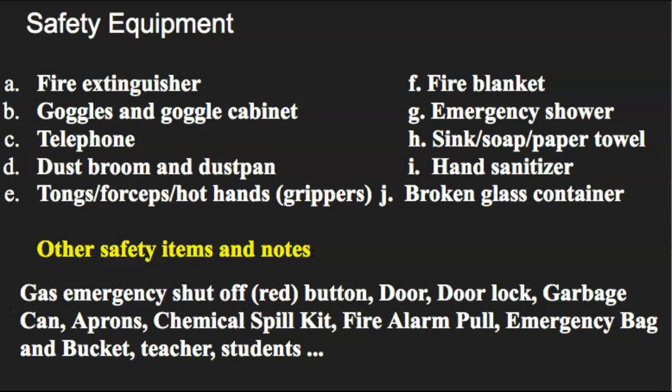Aprons are an option. Now, the aprons don't have to be worn all the time. However, if you're wearing nice clothing and you want to protect it, feel free to wear an apron as long as you fold it up and put it back where it belongs. The aprons will be required for a couple of labs when we use chemicals, just to help prevent them from spilling on you. It's a good idea to use them.